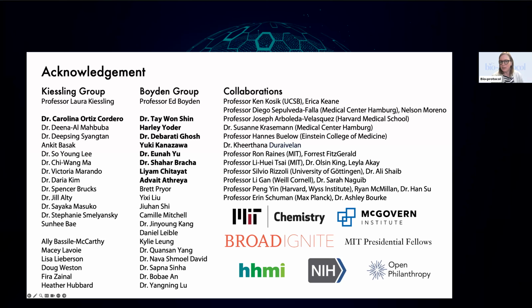Valentine asks, have you tried replacing DTT with TCEP? We haven't. I think it's definitely possible. And if you're having trouble with softening, there are definitely a lot of things that you can try to help with the reducing agent, or a higher temperature, or things like that.